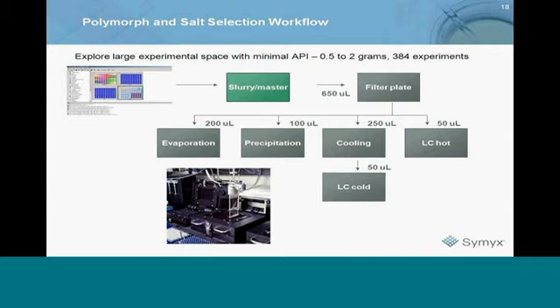Okay, we have quite a few questions coming in. Another one here is, how will the instrument go about if I wish to carry out solid-state stability study? And can it provide humidity along with temperature condition control? Sure. So the answer is we certainly can. This whole process could be used for doing solid-state stability studies.